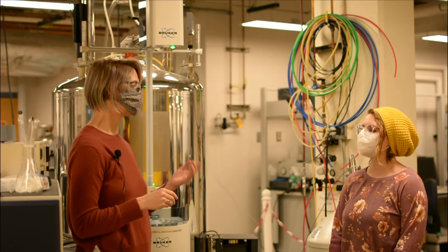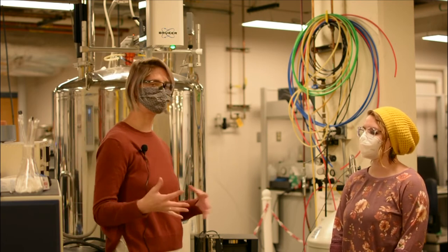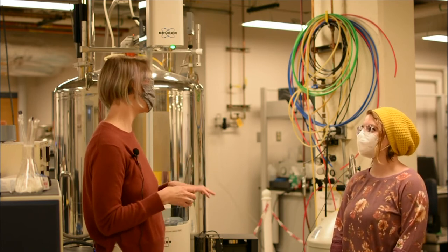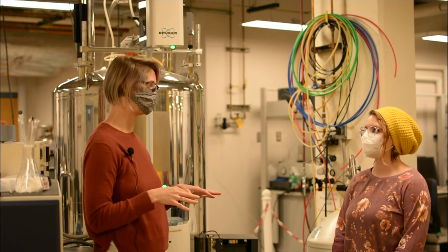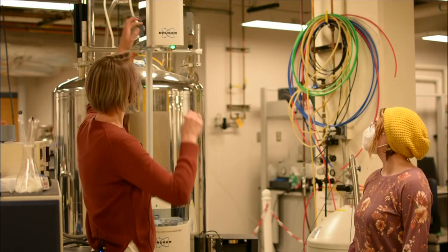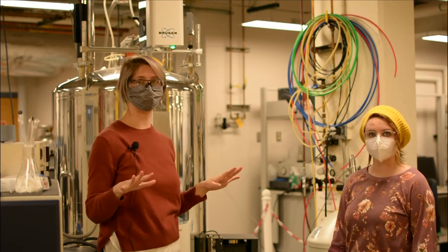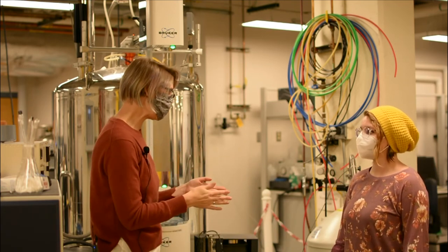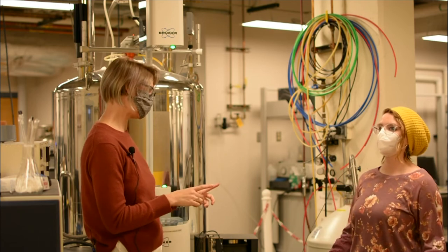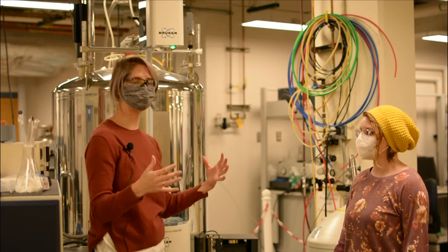The last part of keeping yourself safe is probably the most important. Rarely, something called a quench can happen with the NMR instrument. In a quench, the temperature inside the magnet goes above a critical point, causing all of the cryogens — the liquid helium inside the magnet — to evaporate rapidly. You'll see vapor shooting violently out the top of the magnet, forming a condensed cloud that spreads and descends, displacing all of the air in the laboratory. If you stay in the laboratory when a quench is happening, you will suffocate and die.